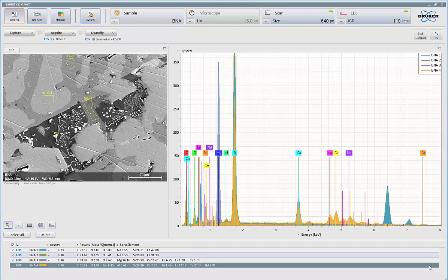When you see a variety of differences, like we are in this sample here, so that many phases exist, one way we can document this is through X-ray mapping.